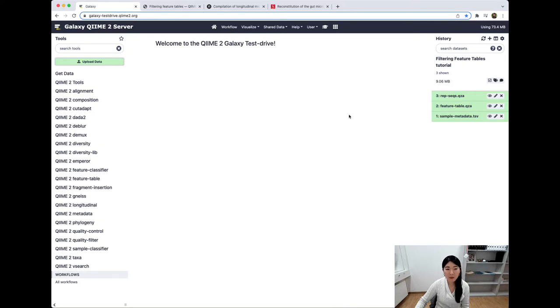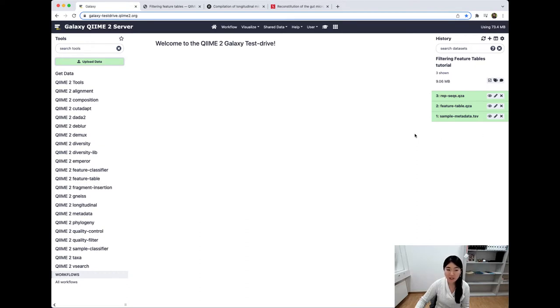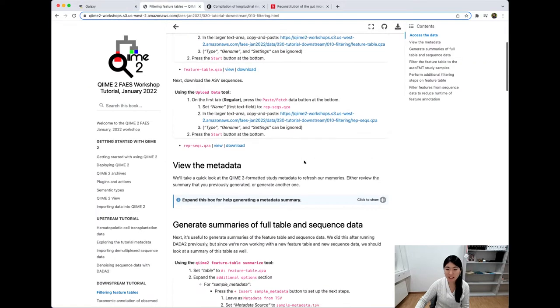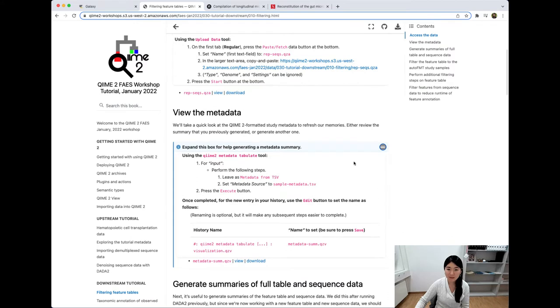Now we want to look at the QIIME 2 formatted study metadata to refresh your memories. My sample metadata TSV is already loaded in my history, and it should be in yours too. You might already have a summary in the form .qzv, a QIIME visualization. If you don't, like I don't, then you can follow along with me. I'll generate that metadata summary .qzv very quickly, and if you want the instructions, they're also right here in this dropdown. It tells us that we want to run the tool QIIME 2 metadata tabulate.